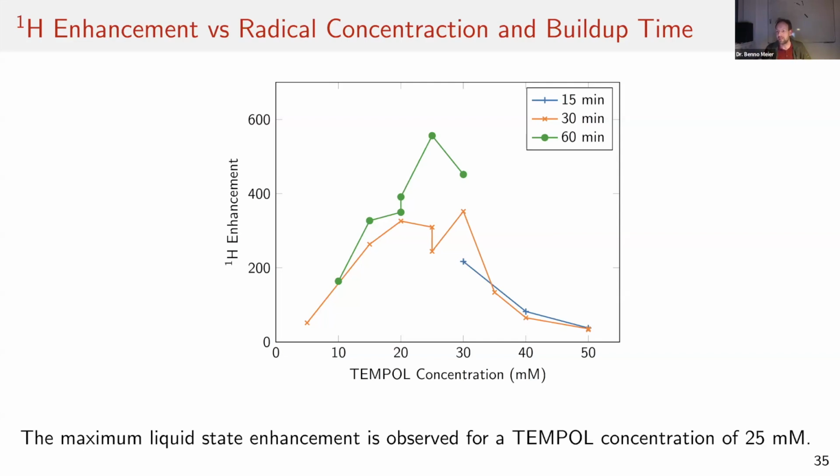But then basically someone needs to come in, have a look, clean it. And so right now it hasn't done another 20 experiments, but once it's running, it has a high chance of keeping on. Cool. It's a prototype. Almost a product to sell.